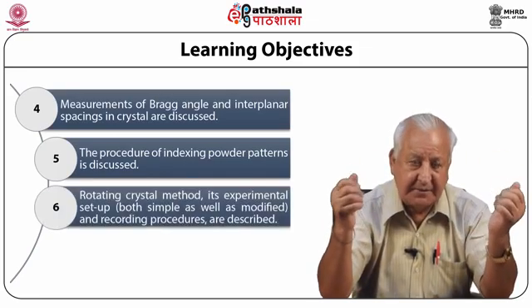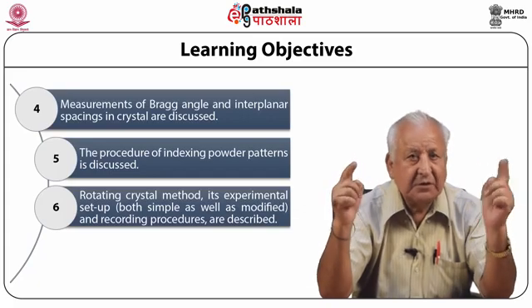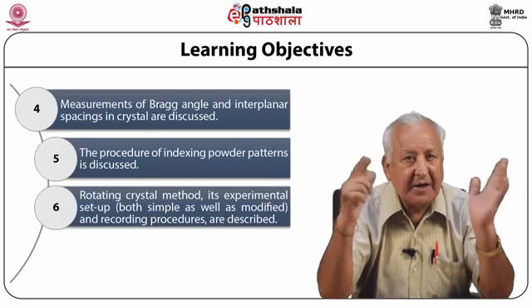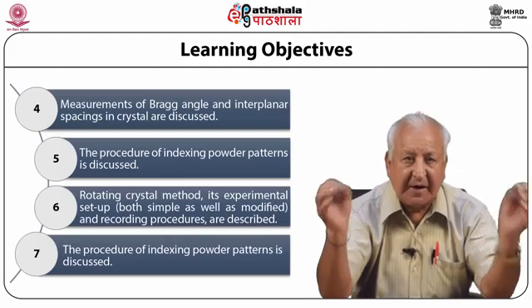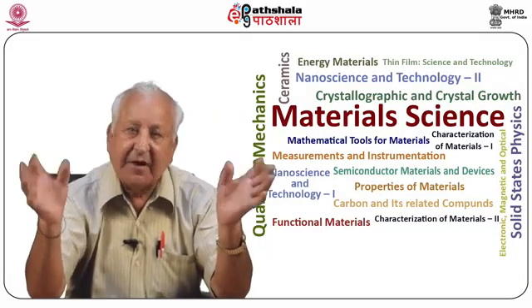Rotating crystal method, its experimental setup, both for simple as well as modified ones, and recording procedures are described. The procedure of indexing powder patterns is discussed. Experimental methods for X-ray diffraction.